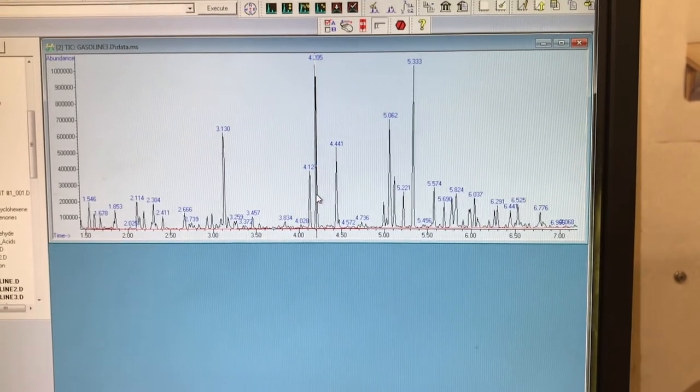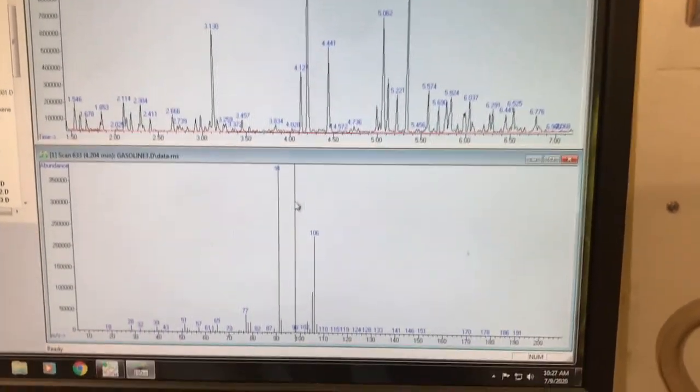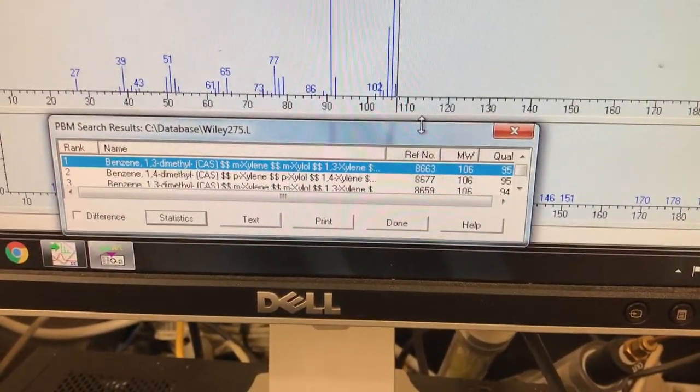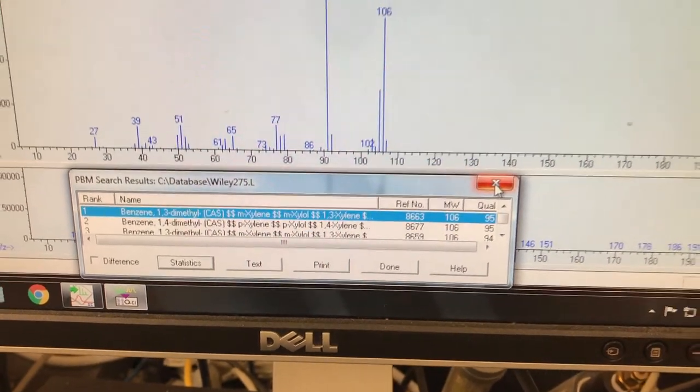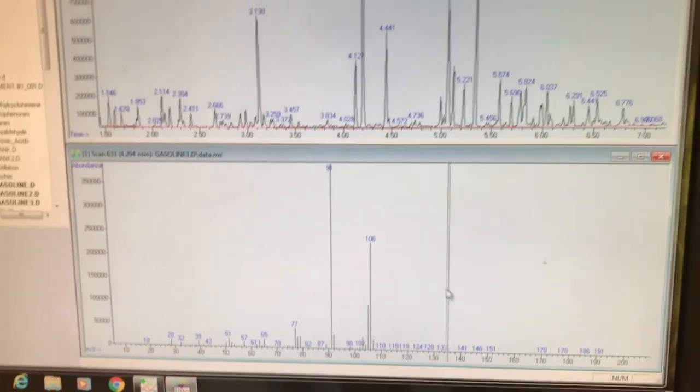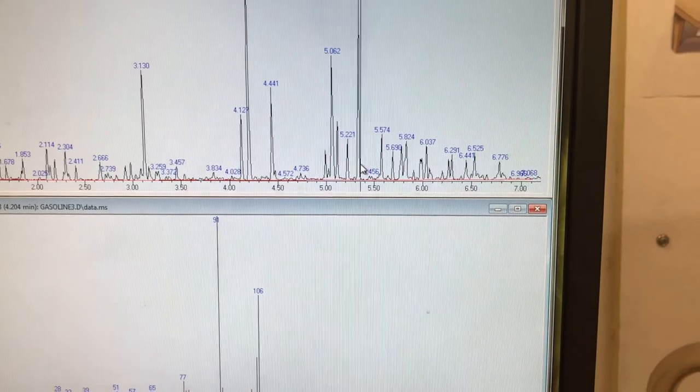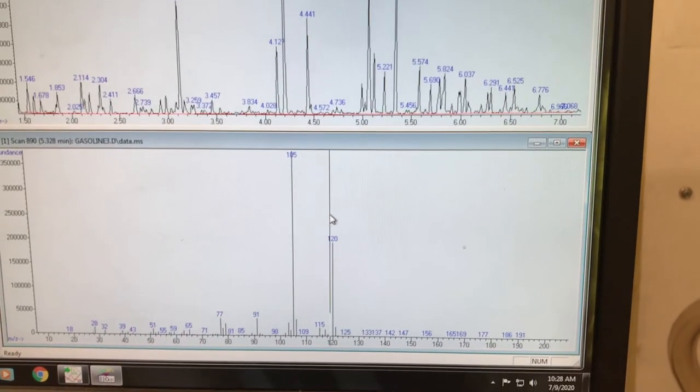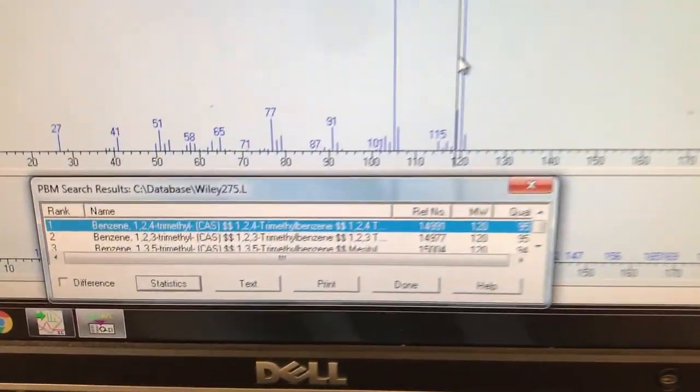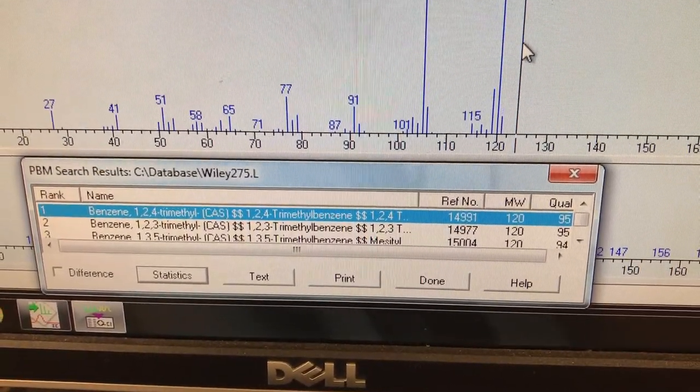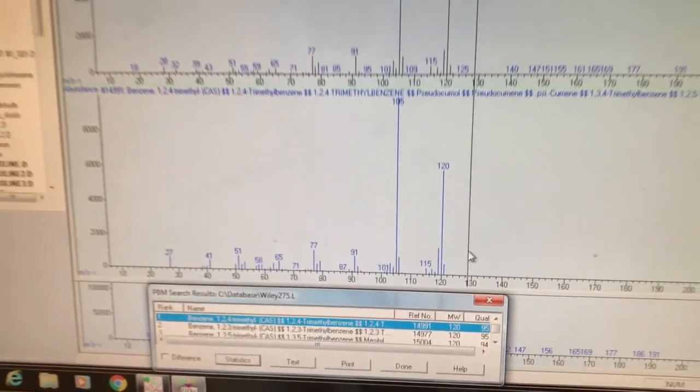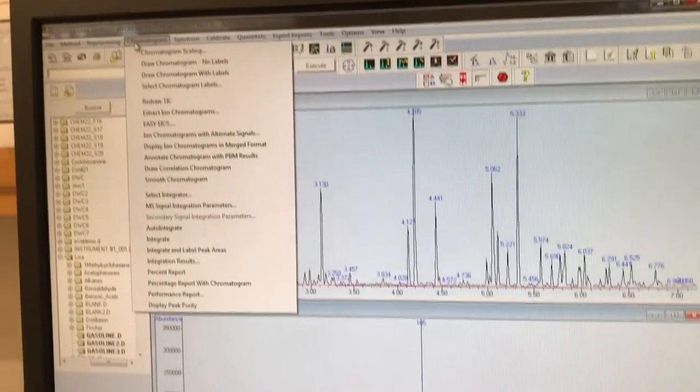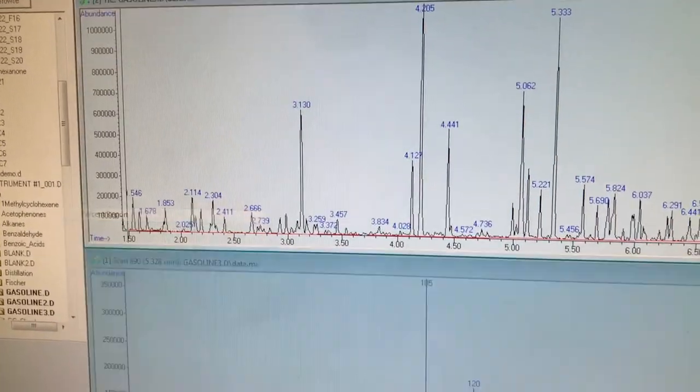Next what you can do is double click on a peak and then double click on the mass spectrum that it brings underneath it and you can use that to identify the peaks. This only works if you have a mass spectrometer detector. Let me show you again on this other one. So you double click and then double click on the graph underneath it and what happens is it asks the computer to match the mass spectrum to a database that has tons and tons of very common molecules in it and so then you can see which one it is, is it a good match, and identify the signal.